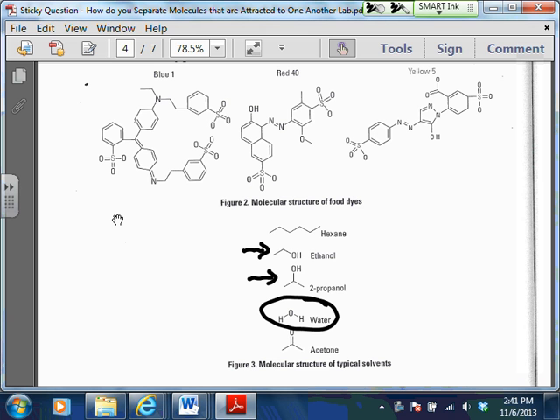The acetone, I'm thinking probably wouldn't have worked very well at all, so that's your next. So maybe 1, 2, 3, 4. And then hexane, we know this because any of you who tested hexane today, it didn't move at all. Nothing moved. So that would be my guess as far as your order.